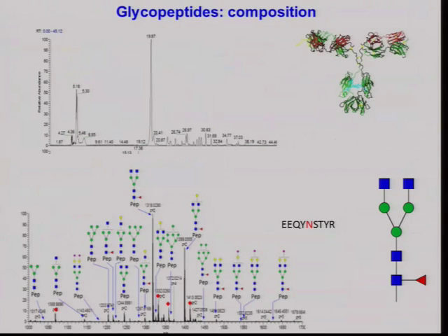So this is one fragment from IgG, this is the asparagine side. And you know what your range of sugars are because you've already analysed them. So you can take the mass of this, and then add the mass of all of the sugars that you know could potentially be at that site, and then you can look for them.